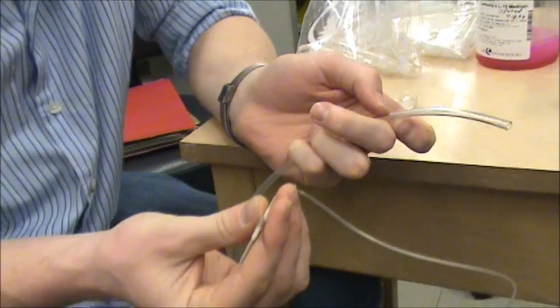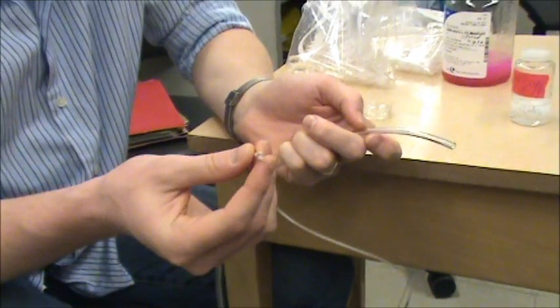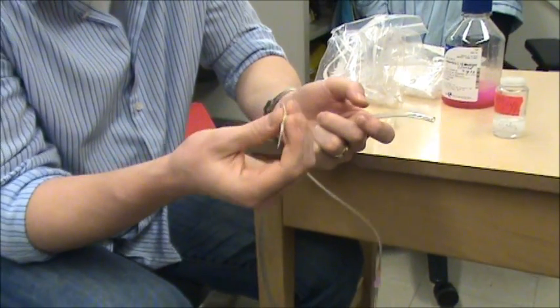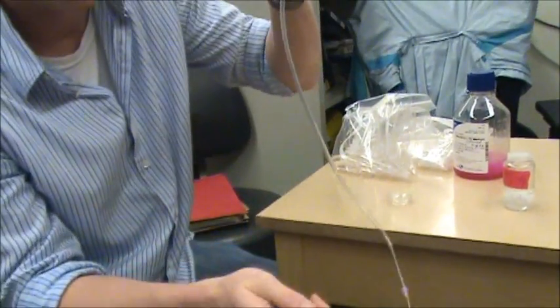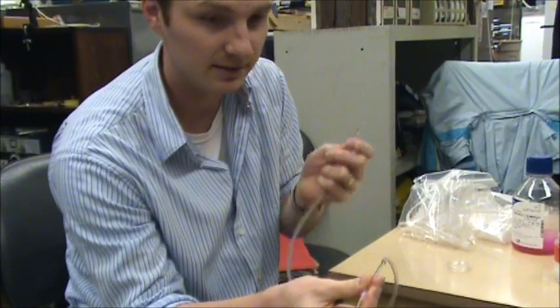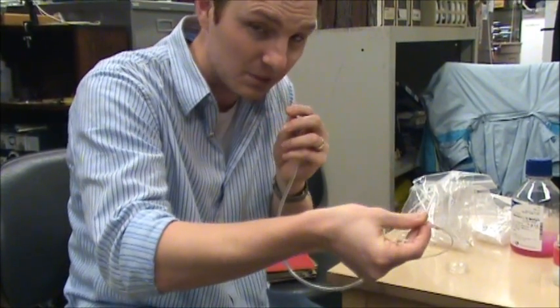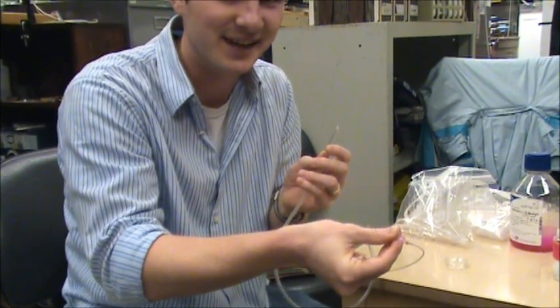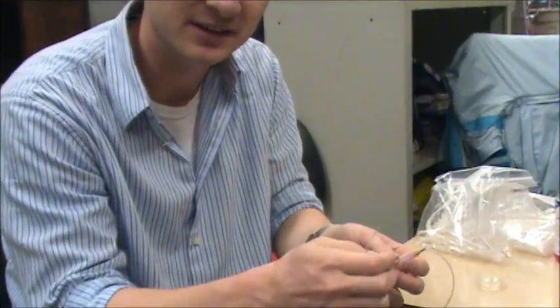And then this apparatus is what we use to actually aspirate the cells. So the pipette is taped onto the smaller tube and then it's fixed onto this plastic syringe and onto a larger tube, and we suck the cells right out of the ganglion.